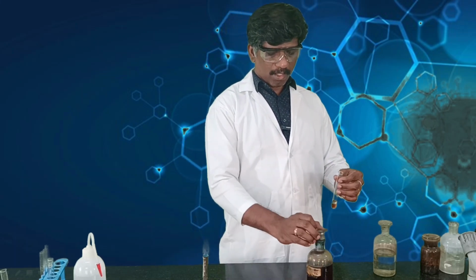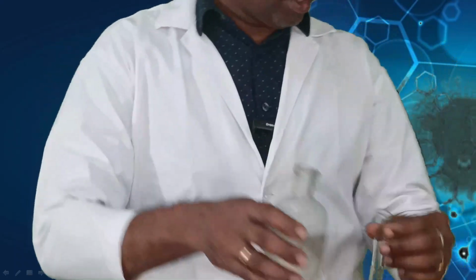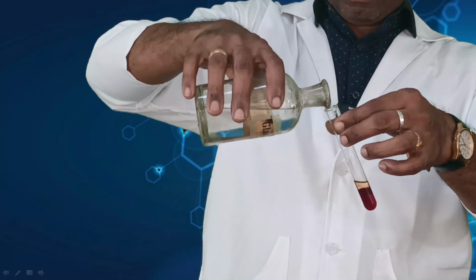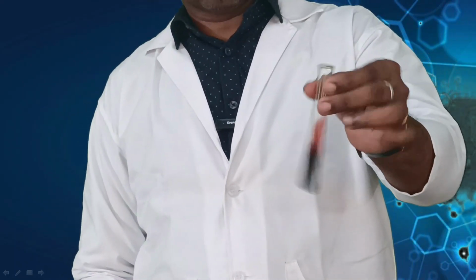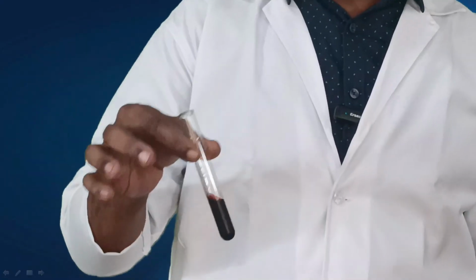And then add 1 ml of sodium hydroxide, and then add a few drops of glacial acetic acid. Formation of this dark color, this dark brown color shows the presence of ketone. Either this dark brown color or dark violet color shows the presence of ketone.